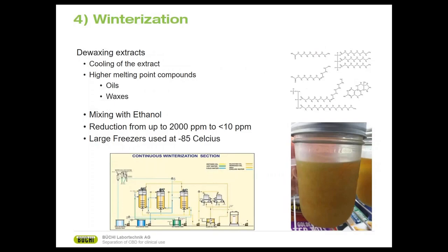Winterization. As we mentioned before, winterization is the step to remove the waxes from the crude oil. Basically, a 1 by 1 volume of crude oil and ethanol is mixed and put into the freezer at -85 degrees. This is close to the freezing point of the ethanol. We don't want to freeze the ethanol. We just want to react the ethanol with the waxes and precipitate them.